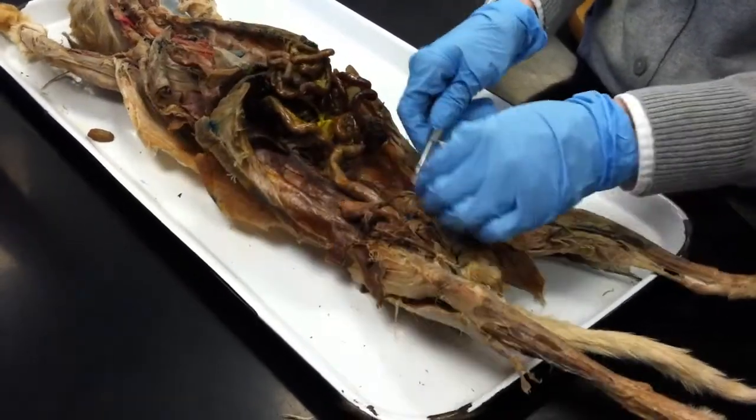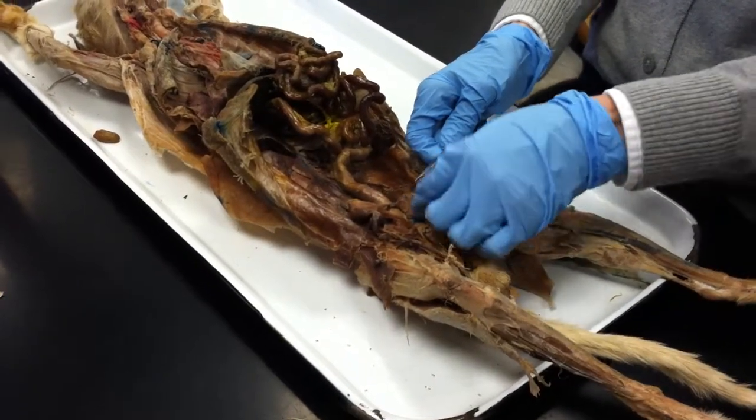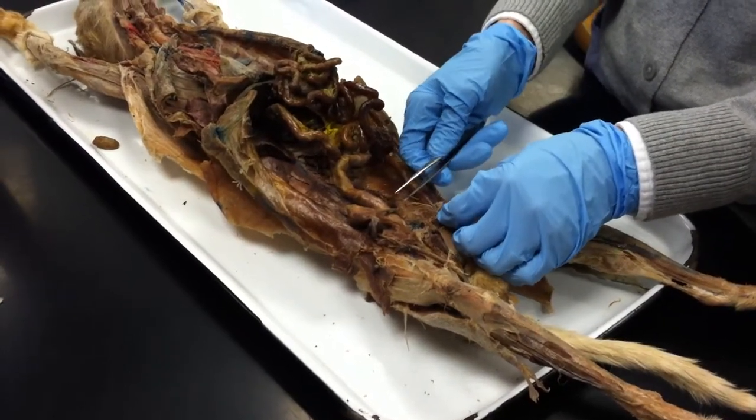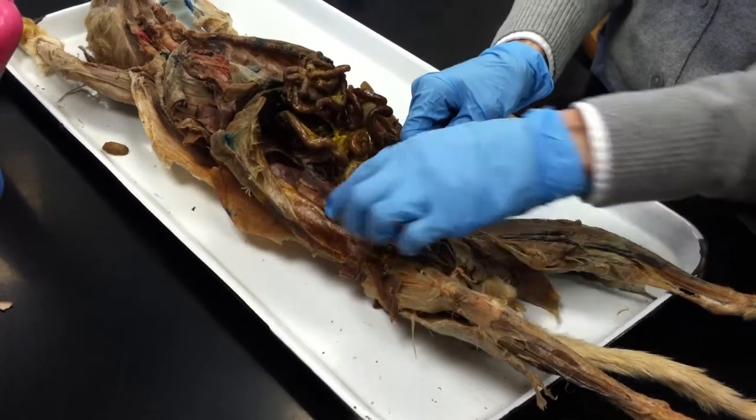Once we get into the abdomen, we have a fork here. There's a fork in the road. The artery and the vein go on up, either they're coming down from the aorta or the vena cava. And then the spermatic cord branches off this way.